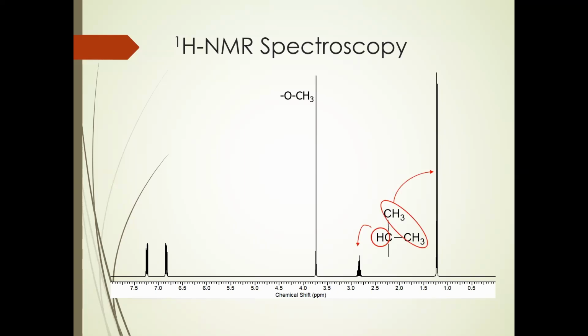And so we always look at our spectrum, we look at the splitting, tells us septet, 6 neighbors. Likely way we get 6 neighbors is 2 CH3s. Again, it could be other things. It could be 3 methylenes, but given that we don't have methylenes, we only have methyls, we can be certain that's 2 methyl groups there. But anyway, that shows the splitting there.